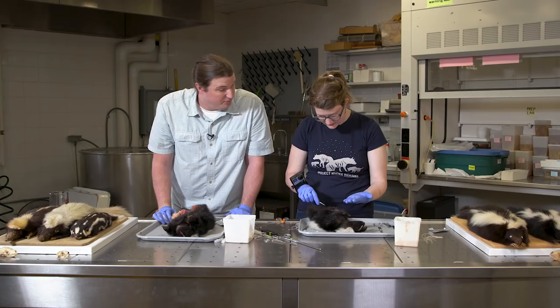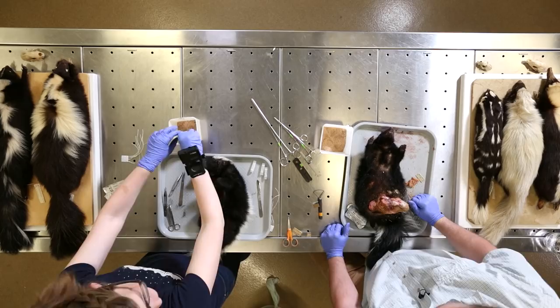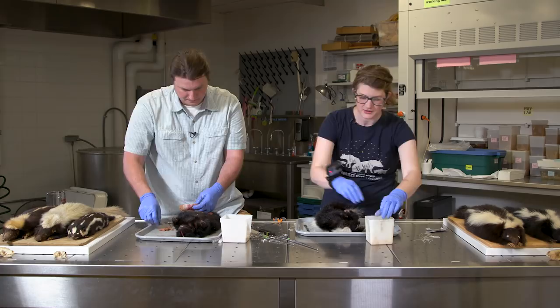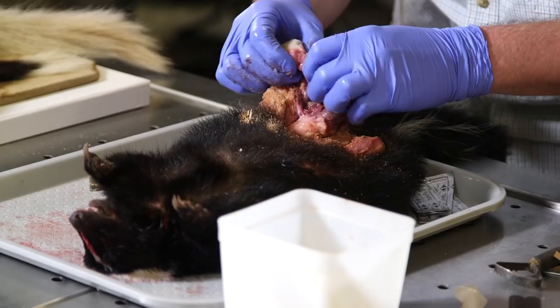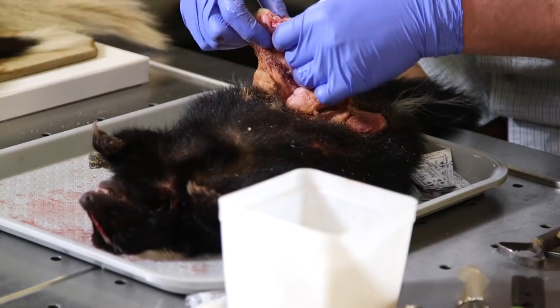We're double-gloving it. We don't normally wear gloves for dissections on The Brain Scoop, but on skunks you need to — unless you want to be smelling skunk for weeks afterwards, because even if you don't rupture the gland, the smell permeates the body and different regions you might touch.